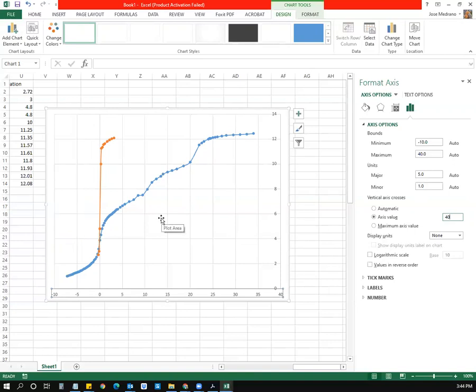But what we do require for this one graph, I believe it's prompt B, or not B2, sorry, it's going to be A2. No, it's B3. You want to plot your titration data, millimoles on the x-axis, pH on the y-axis, both of them on the same graph.